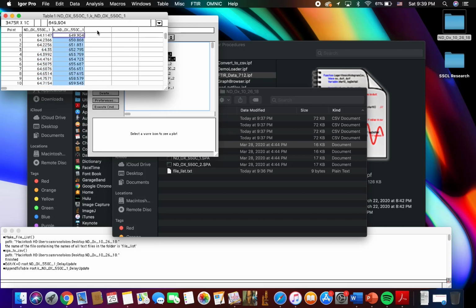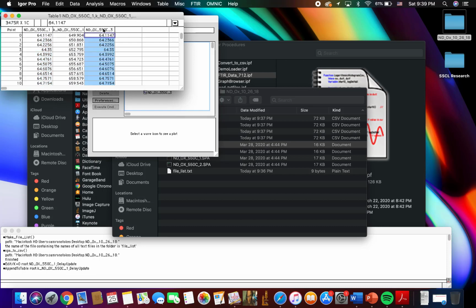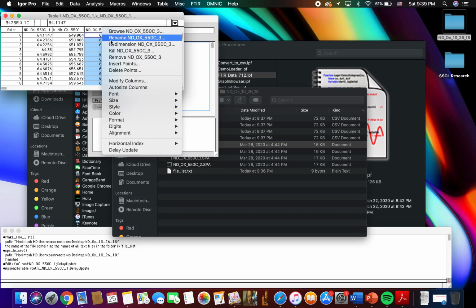This is where we're going to start making our line column, our norm column, and then our KM transfer column. And I'll show you how to do that right now. So click on any column like this one and just copy, and then click on the third column and paste. Now we want to rename it because this is going to be the line. This is going to be our line column. So you want to correspond with that.